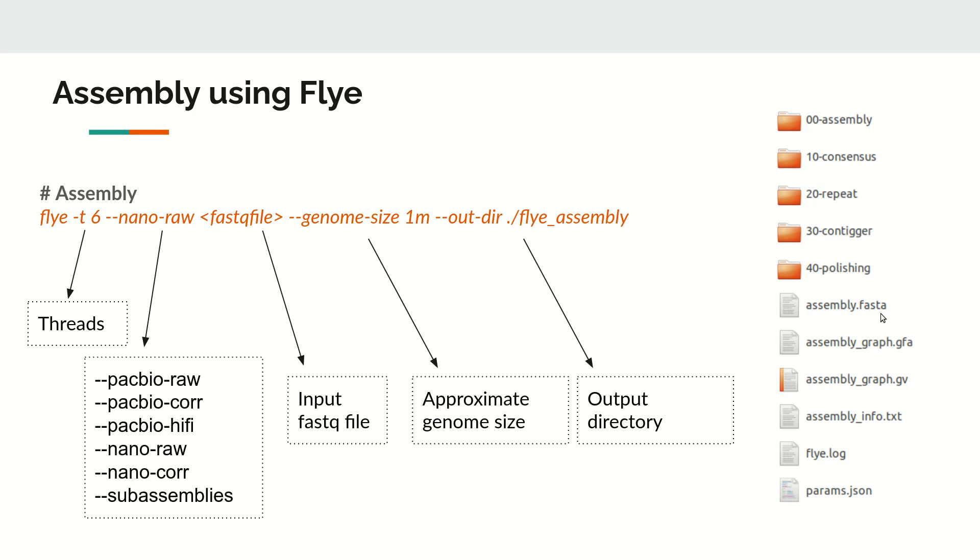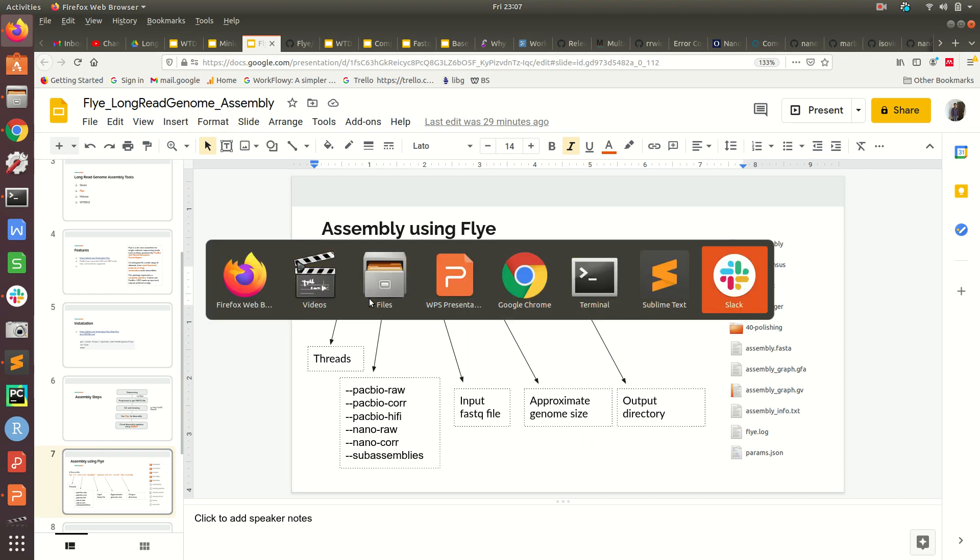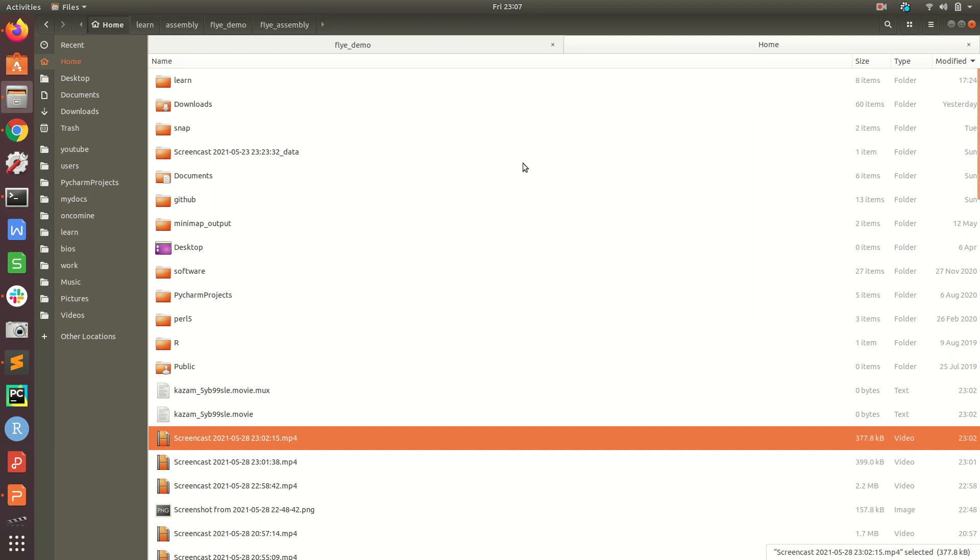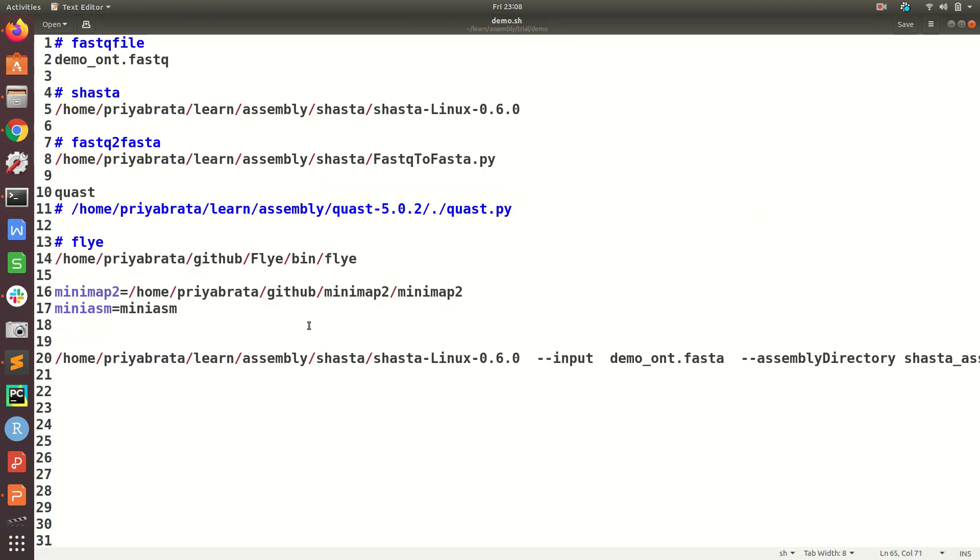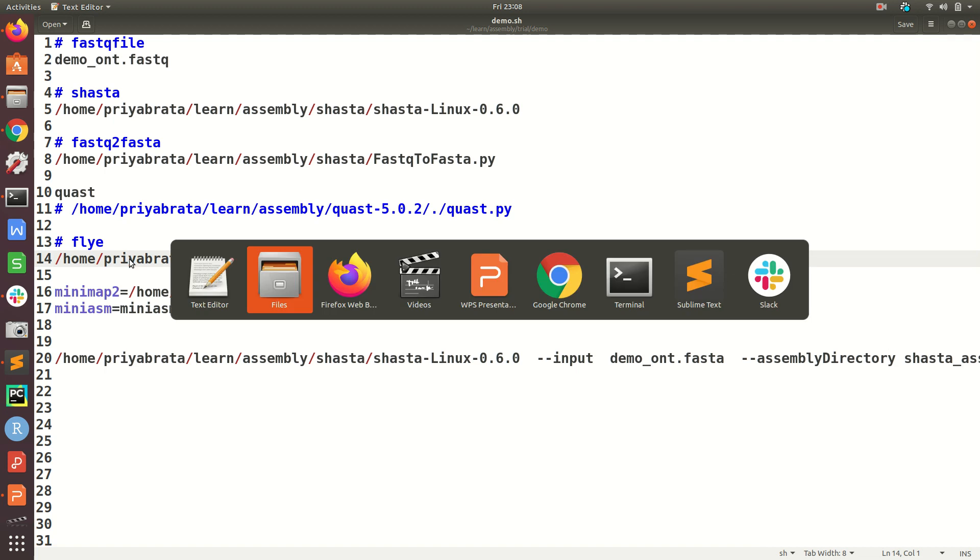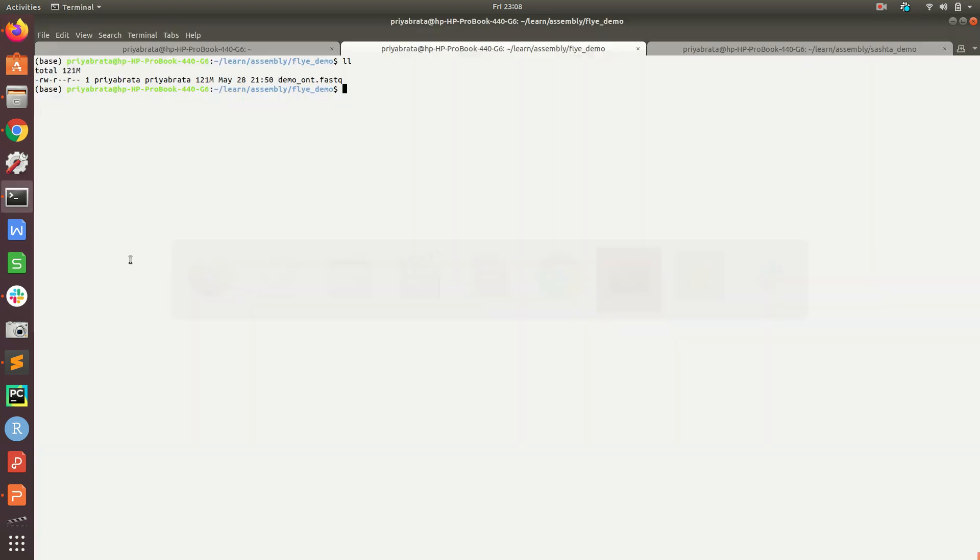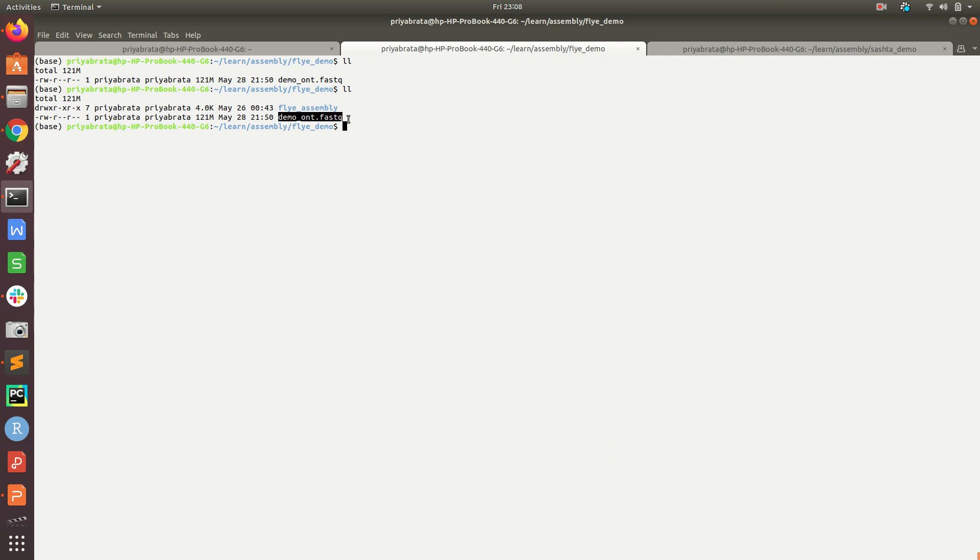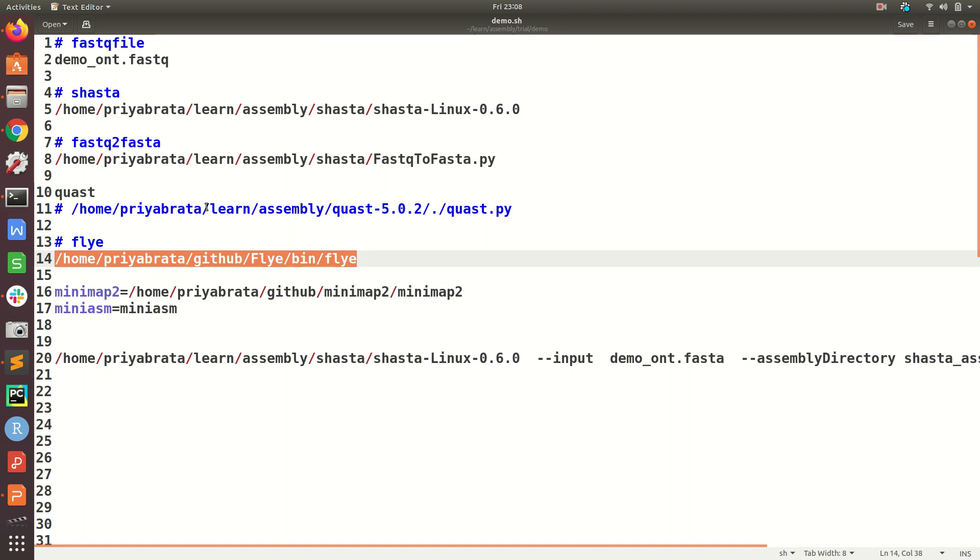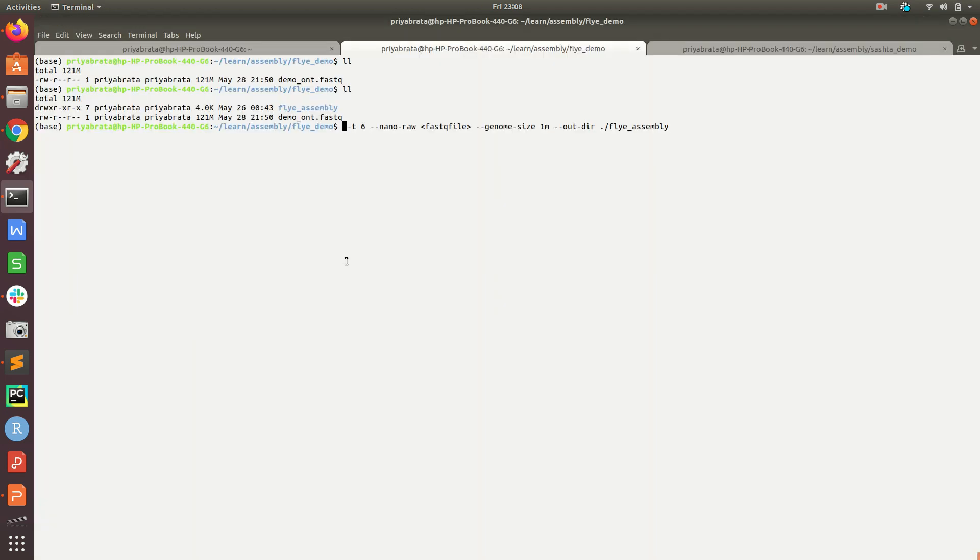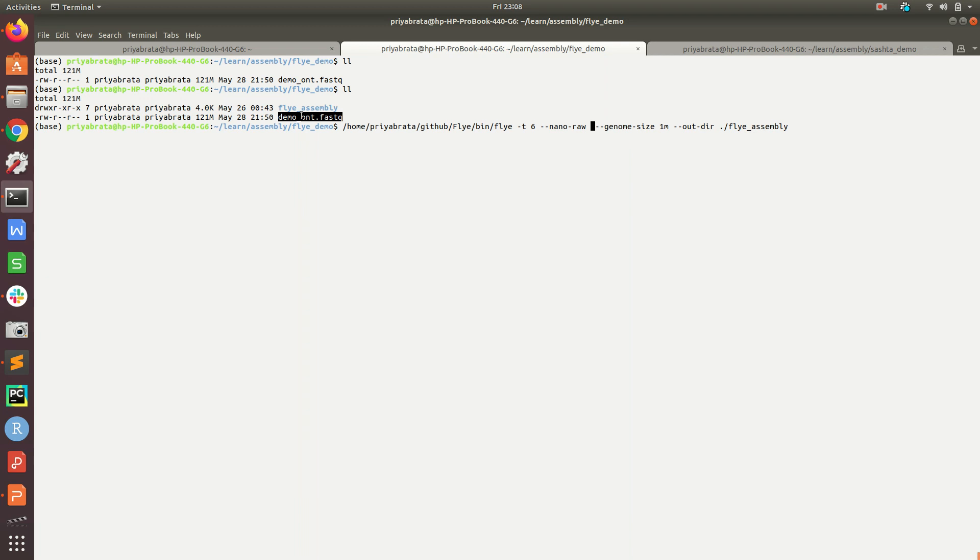First, let's run this command. Let's copy this command and paste it here. So you see we have demo_ont.fastq as the input file. I will replace flye with the path to the flye command, which is installed in this path. Then number of threads is six.